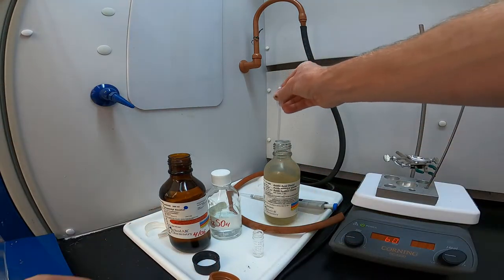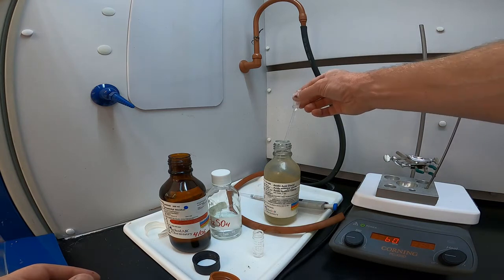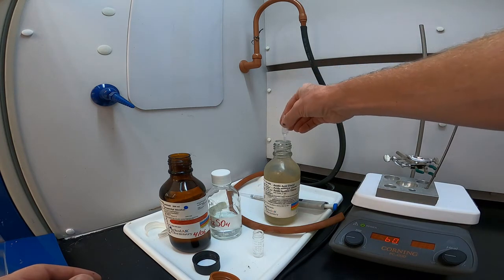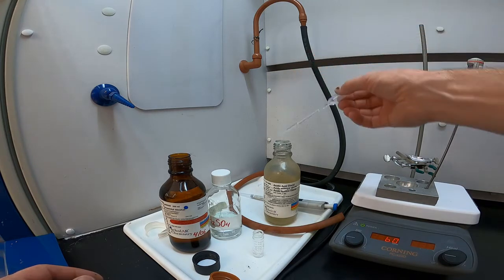Then an excess 1.5 milliliters of glacial acetic acid, and for this I'm just going to use the graduations on my plastic pipette, because this is going to be an excess, so it's okay if it's a little over.